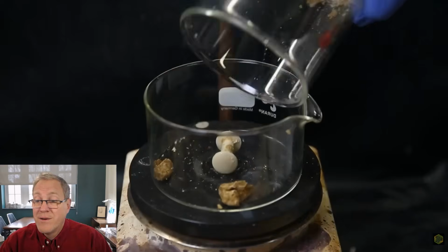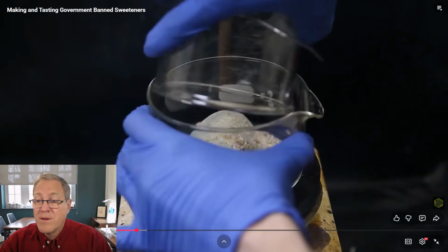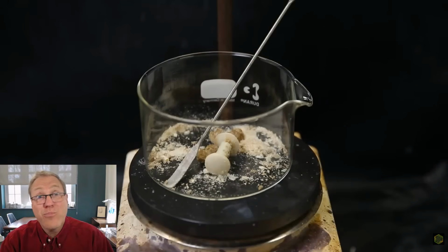I then move it all to a crystallizing dish, and it is obviously not pure, evident by it being mostly brown chunks. That brown color, I bet that's pretty nice stuff. It takes so little colored impurity to impart a lot of color. I think that looks pretty good.